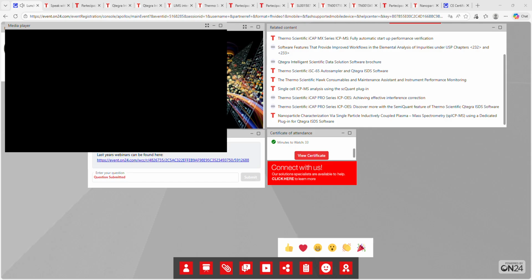Okay. I don't know if this is possible to answer right now or if you have to take this offline with the customer. I have a TQ ICPMS. When I use the internal standard, I have a result with a high percentage, about 90,000%. I don't know why. Is that something that you can answer now?